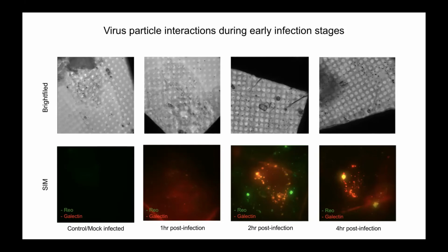It's quite impressive, though, that all the vesicles look structurally intact. So it wasn't like they exploded or anything. They literally just became slightly leaky. And then by 4 hours, we find the virus and this reporter molecule concentrated in larger vesicles. So we already had an understanding about the timings.